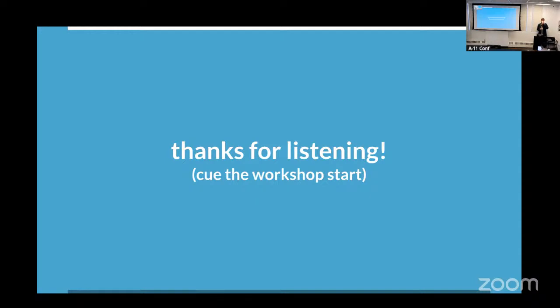Hey. The web interface that you showed looks very nice. What kind of technologies did you use to build it? Yeah, the web interface was mostly built by Dimitri. I've contributed visualizations and a few little components, so that's his work, and thank you for those. I agree that it looks really good. It's built in C# using the Microsoft-provided equivalent of React, which is called Blazor. And then he has had to build a lot of custom components for all of the specific cryo-EM visualization things that you've seen there today.